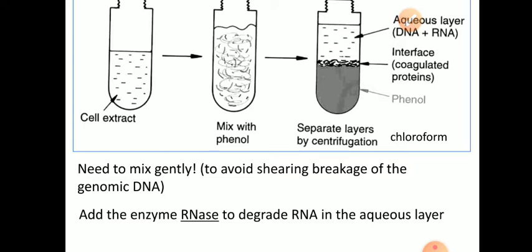What do you have to add? RNase enzyme. What will RNase enzyme do? It will break the RNA. It will degrade the RNA into fine pieces which can be easily separated out in the last steps.